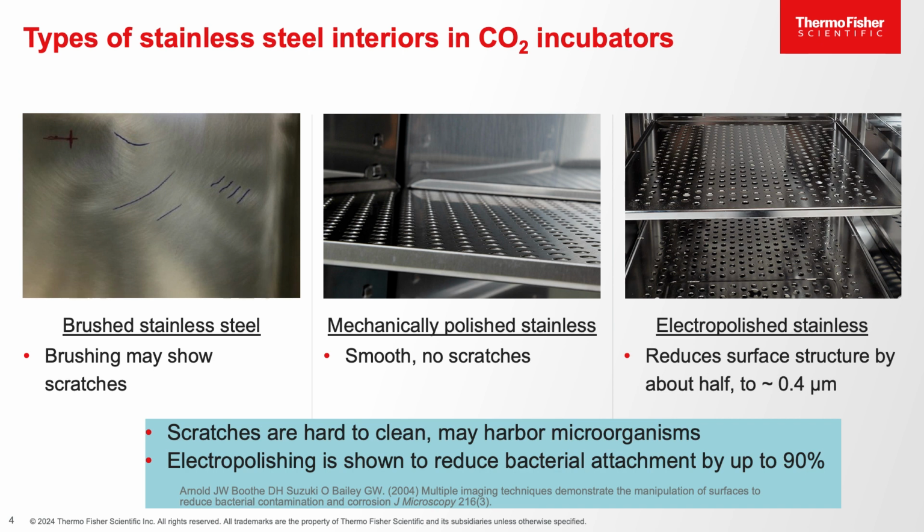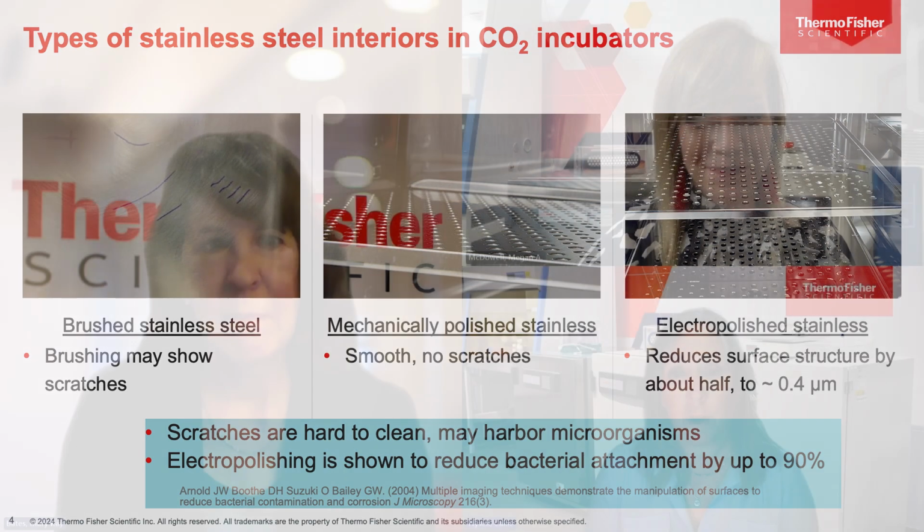This treatment removes microscopic structure and, according to published reports, can reduce areas where bacteria can attach by up to 90%. And Megan, we definitely cannot forget about copper, which is naturally an antimicrobial. Kelly, I've heard about copper. One of my incubators behind me is actually copper, but I don't really understand how that works. Can you explain that a little bit?